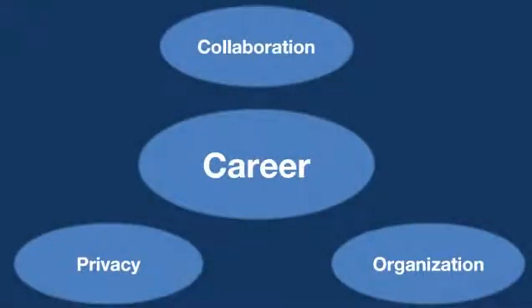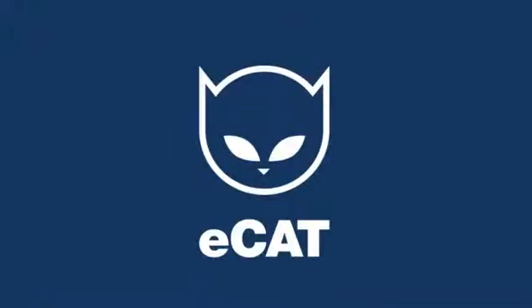Hi, this video is intended for postdocs and graduate students whose labs are considering adoption of an electronic lab notebook. It explains how eCAT, a simple to use but powerful ELN, helps you work more effectively through a combination of enhanced collaboration, privacy for your own work, better organization, and preparation for the next stage in your career.